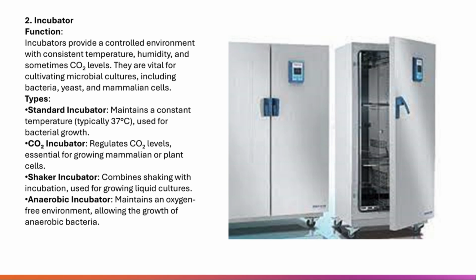Next up, we have another essential piece of equipment in the microbiology lab, the incubator. Incubators are vital for cultivating microbial cultures by providing a controlled environment with stable temperature, humidity, and sometimes even CO2 levels. Without incubators, growing and studying bacteria, yeast, or mammalian cells would be nearly impossible. There are different types of incubators, each serving a specific purpose, depending on the needs of the organism you're growing. Let's take a look at the most common types.